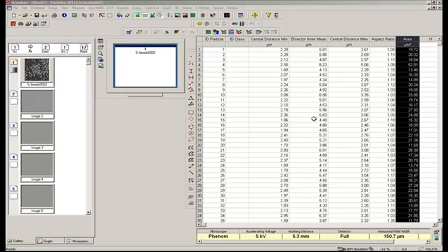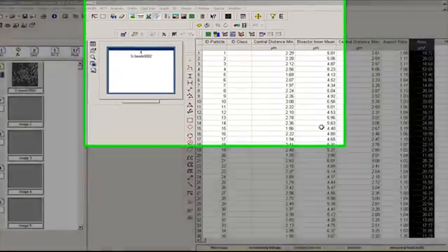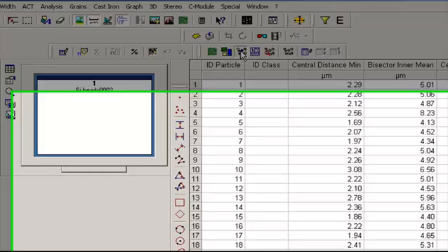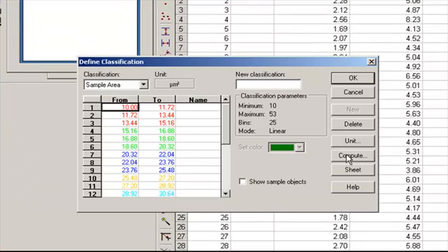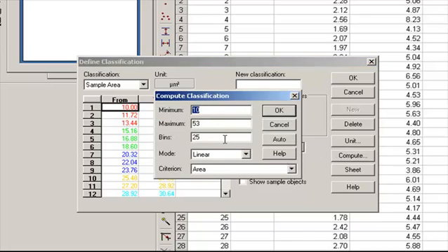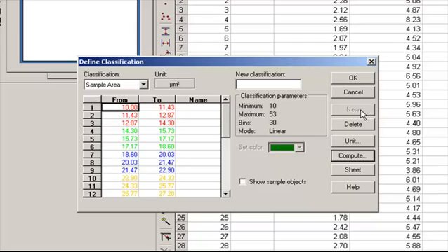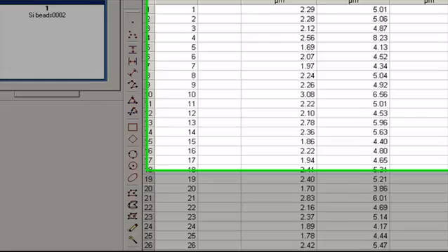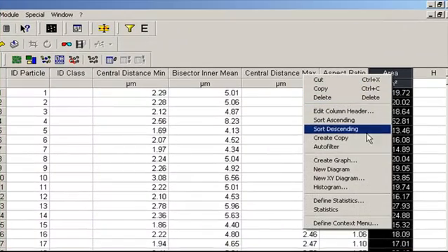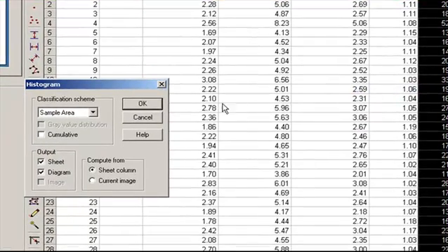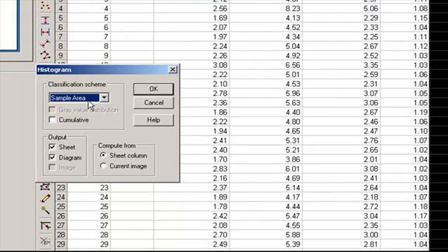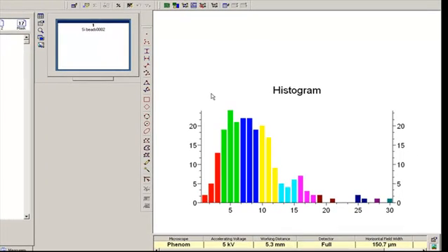To display results graphically in a histogram, go back to the Analysis toolbar, click on the Define Classification icon, then click the Compute icon. In the Compute Classification menu, you can define the number of bins that particles will be grouped into. Arbitrarily picking 30 bins, click the Auto icon and then click OK. Scroll back up to the Area column, right-click on it, scroll down to Histogram, select Sample Area as the classification scheme, and press OK. A histogram will now appear with the specified number of bins.